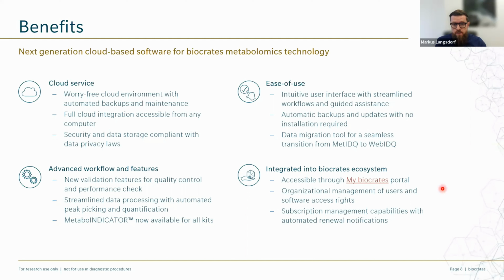WebIDQ is integrated into the biocrates ecosystem and part of the My Biocrates portal, where you can manage user rights as mentioned. So again, you can add up to 10 users per organization and give access rights to those who need access to data. When the subscription is about to expire, you will get automated renewal notifications in time.